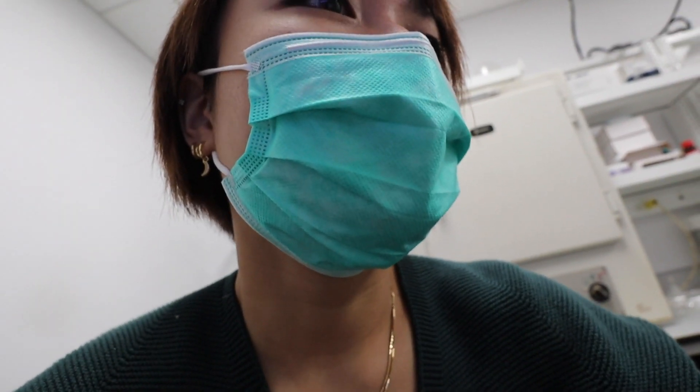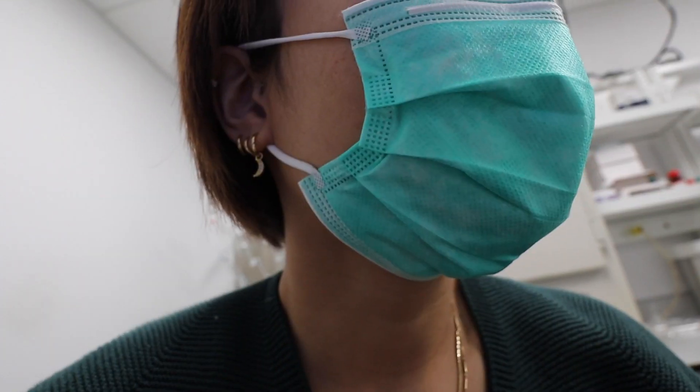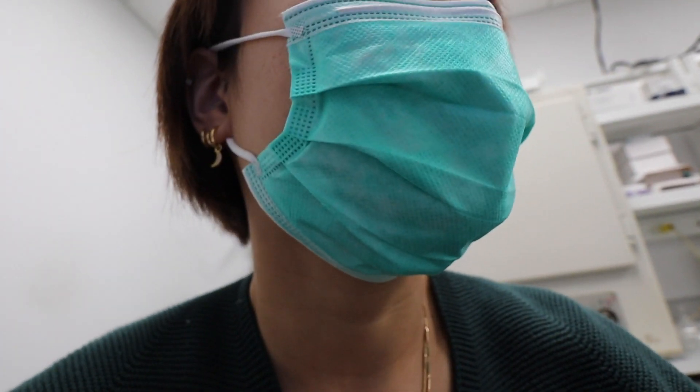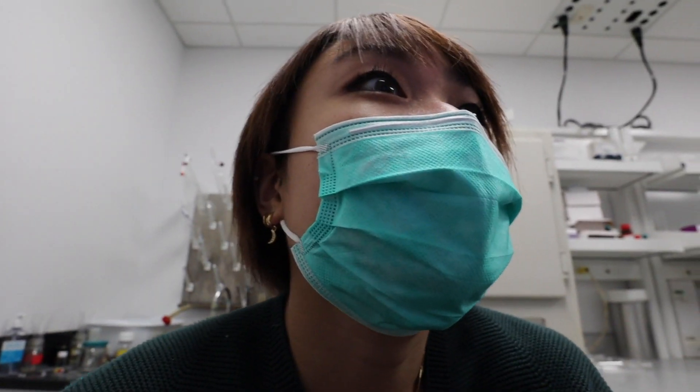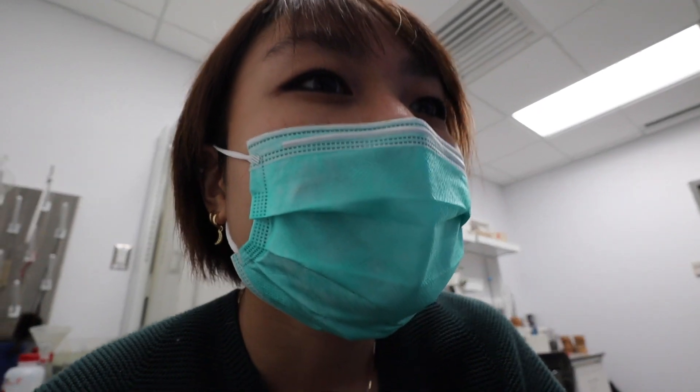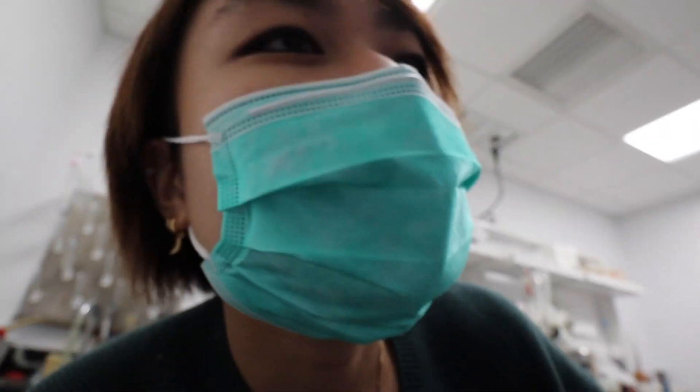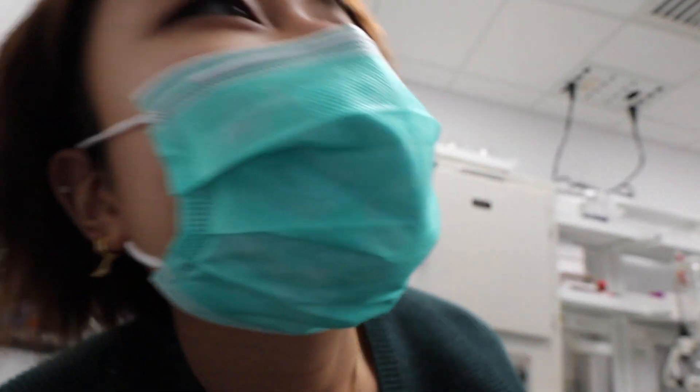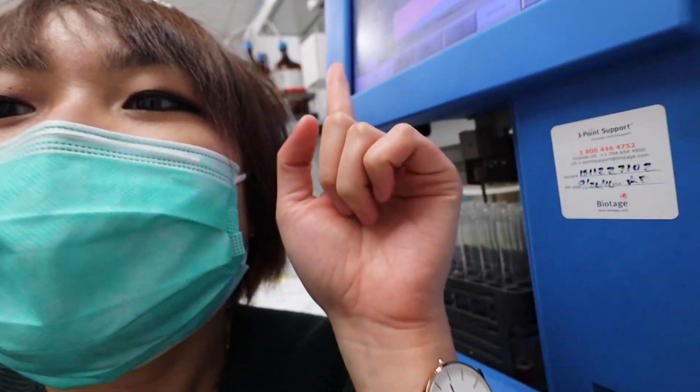I think that was the impurity at the very bottom of the plate, remember from the TLC plate? Like I'm looking at my notes and I think I synthesized this compound in October 2020. Wow, yeah, that's so long ago. I'm so nervous, I really hope my compound is pure. I don't want to do this again.